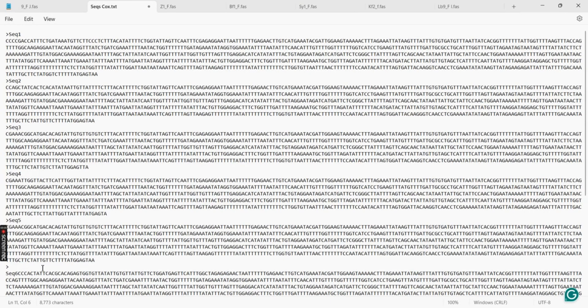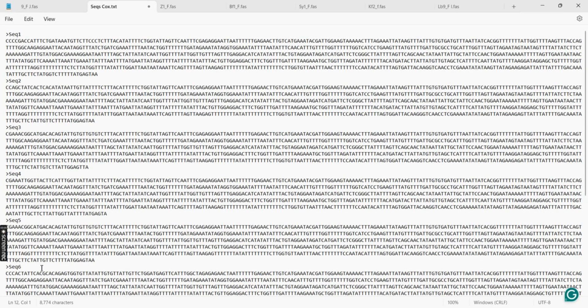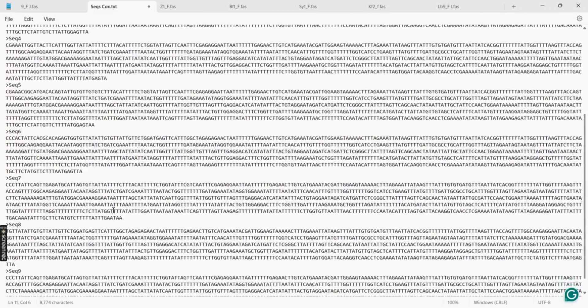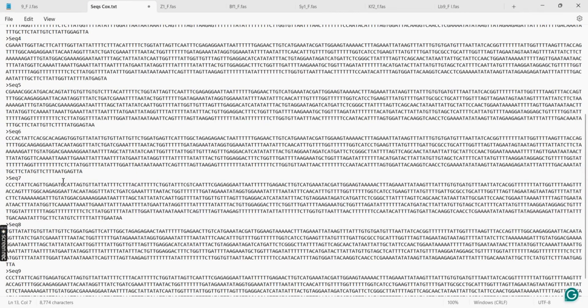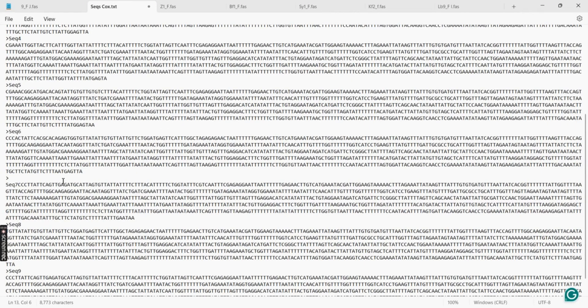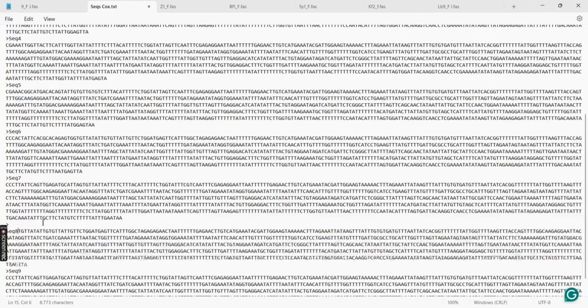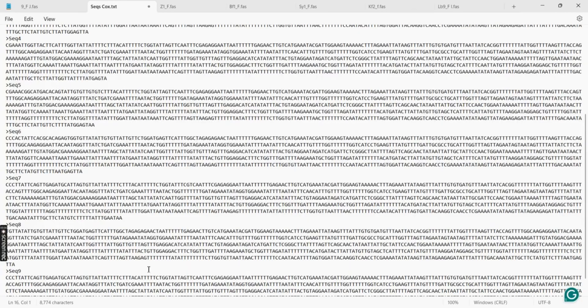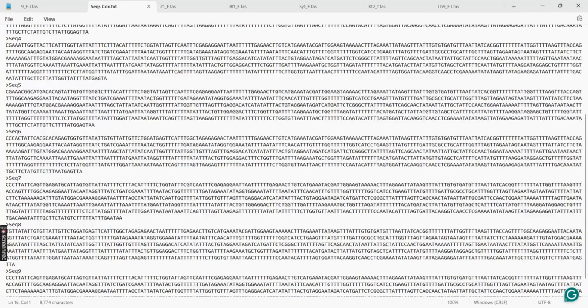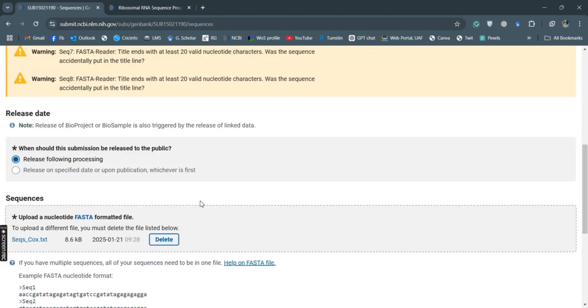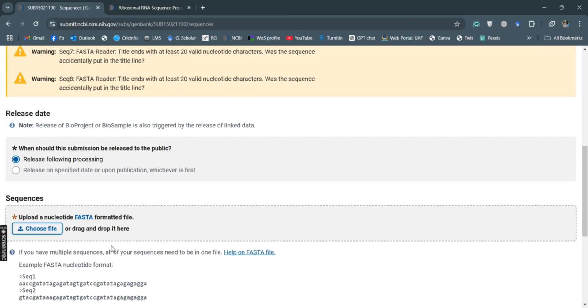And again backspace and backspace and backspace. So I will save it with Control+S, and then delete this file and upload when you want.